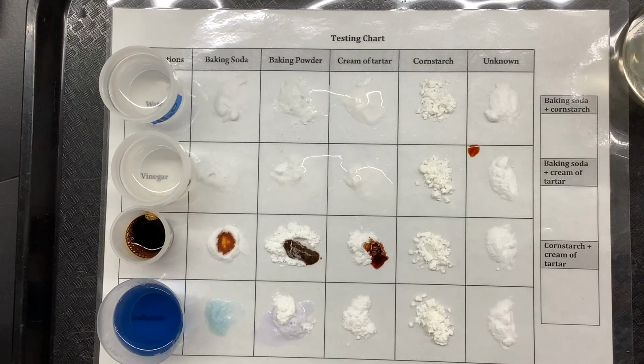That's kind of like red. It's like, that's very red. Okay, now indicator for cream of tartar. Oh, purplish pink. Pretty. That's a nice color. All right, rinse it out, and we'll do cornstarch next.